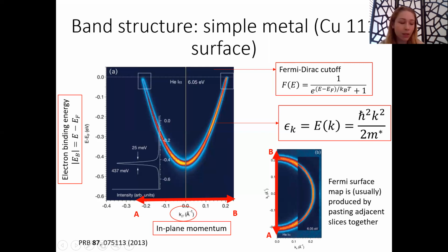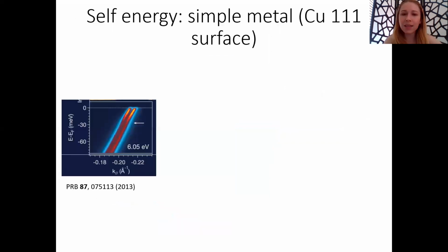That illustrates the fact that ARPES is such an information-rich technique that you can study a material that's been studied before, and if you just look in a different regime, if you do something different to it, if you just look more carefully, you can sometimes discover new things. And indeed, that is what is seen here. There are a couple of aspects that I'll point out.